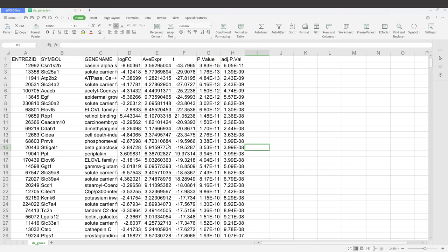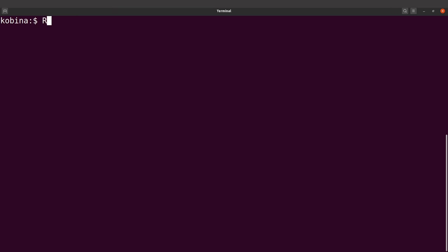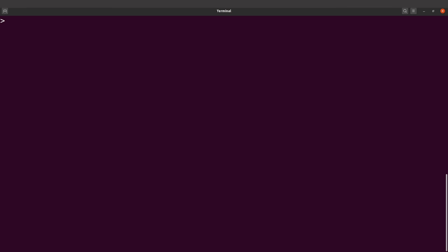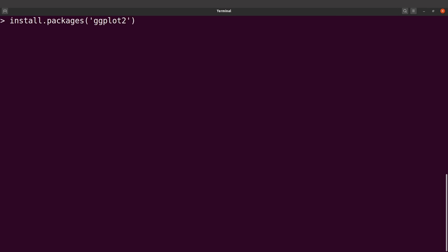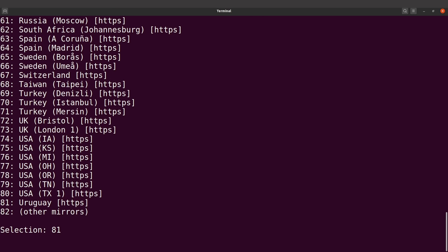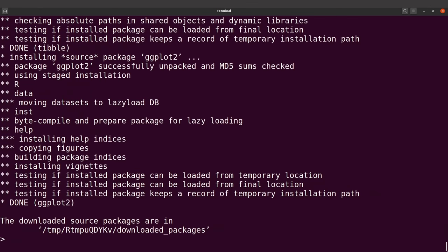Let's go to RStudio. Before we do that, we need to install the packages. I'll load R first. We are now going to install the packages one by one. Starting with ggplot2 — I will say install.packages and give the package name in quotes: ggplot2. That is the first package, which we are going to use for plotting. Let's select a CRAN repository and wait for the installation. The package has been installed.